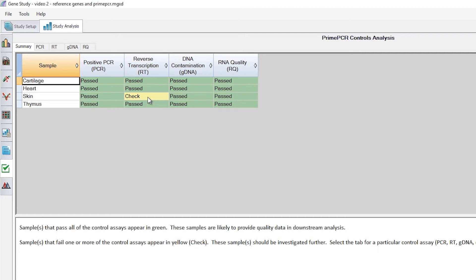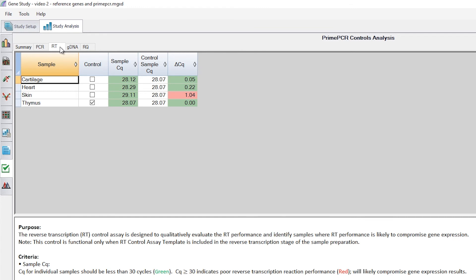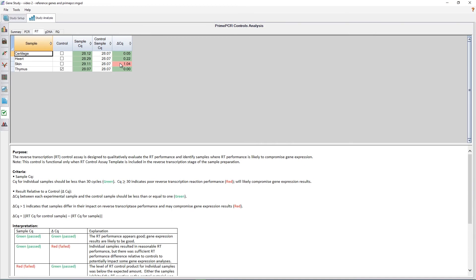The reverse transcription control for our skin sample says check, meaning we should further investigate the results. To do so, at the top of the analysis, we'll click on the tab labeled RT for reverse transcription. Now we can view more information about the results, including comparative CQ values and a delta CQ. As we can see, the delta CQ between the sample and the control is high, indicating that the reverse transcription reaction might not have run well for this particular sample and could be impacting our results. We can also see that the lower half of the screen contains more information and an explanation of how to interpret the results.